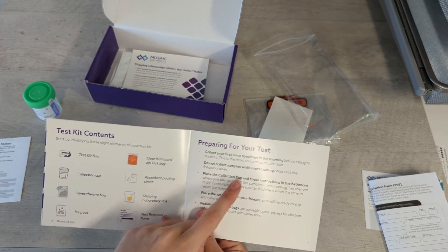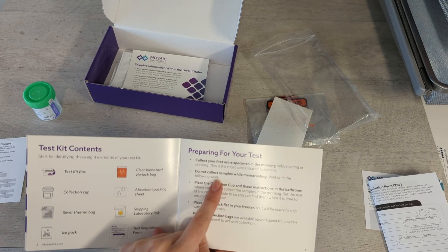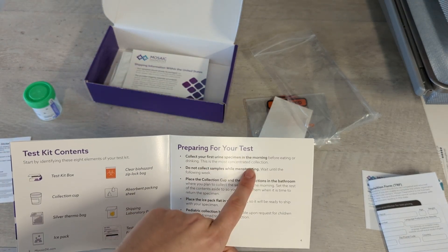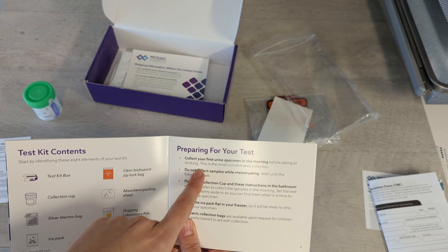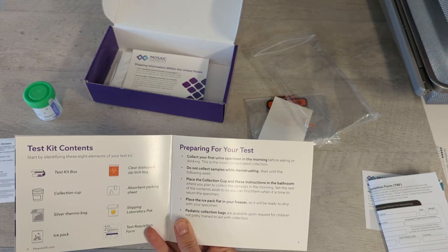Please don't collect your samples if you're menstruating — wait until the following week to collect the sample, as we don't want to contaminate it with any blood. We are also going to do a fasting test, so you're going to do this before eating or drinking, so that it's the most concentrated and the most accurate that we can get it.